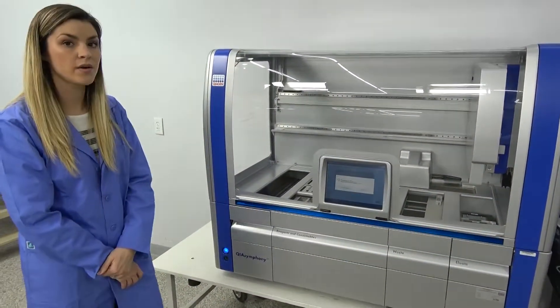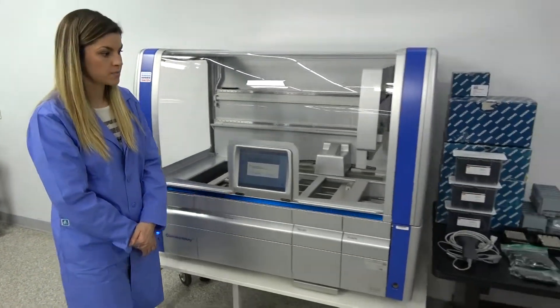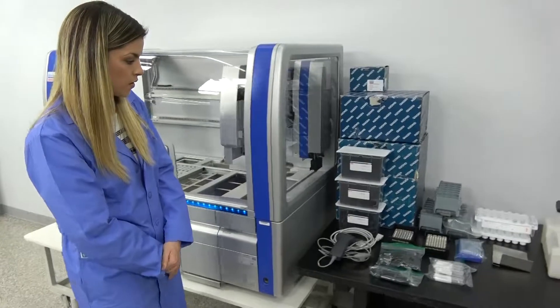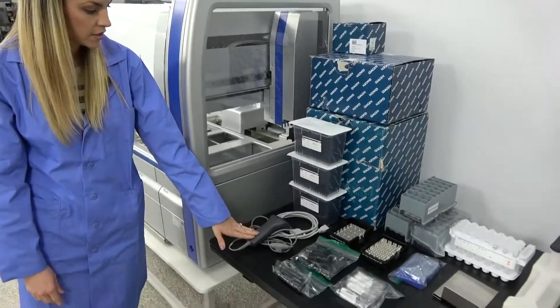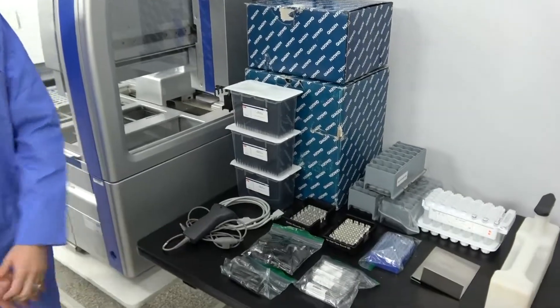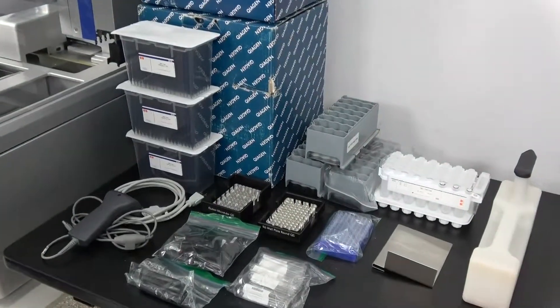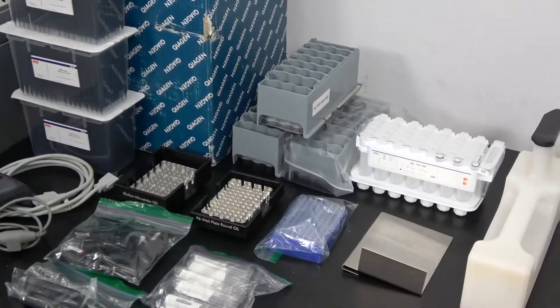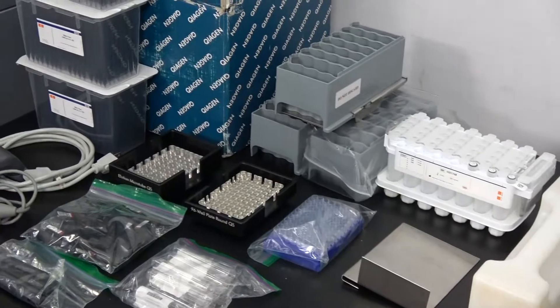This unit is also actually available with some consumables and accessories. We have several things that can go with this unit. We have a scanner, test tubes, and just some other accessories that are available, including the waste container. So there are several things that you can pair this machine with.